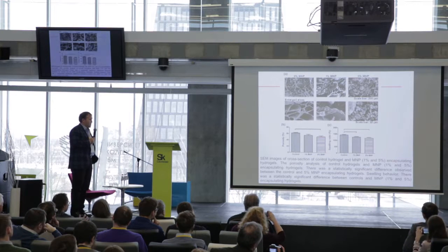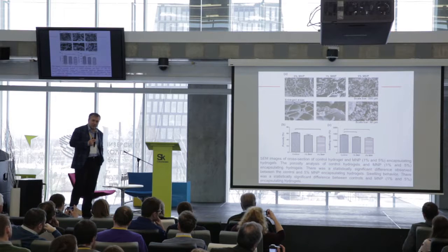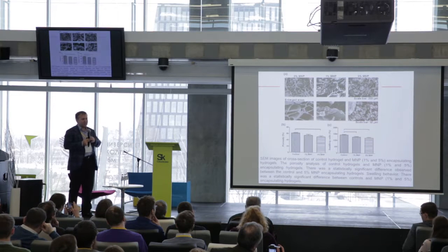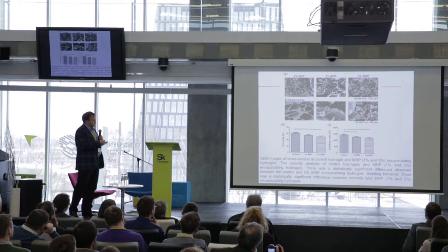One issue we had, not for pharmaceutical applications, I would say, but for tissue engineering applications to make an organ system or a patch, was that if you are going to implant it, since you have these magnetic nanoparticles, you see this is the methacrylated gelatin SEM image, you don't have any of these magnetic nanoparticles in there. But as you load and make the gel more and more magnetic, you start seeing some issues with the porosity.